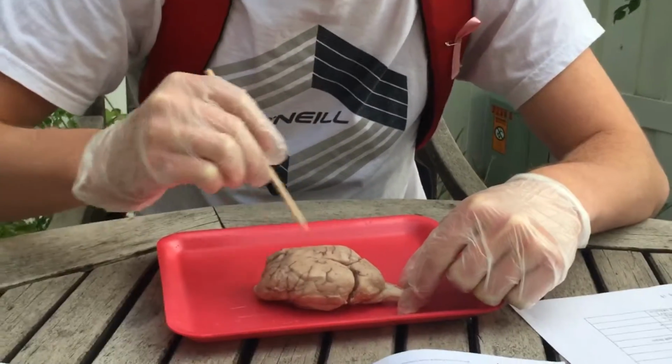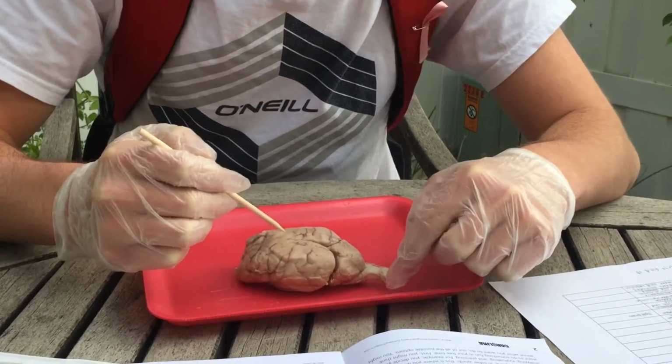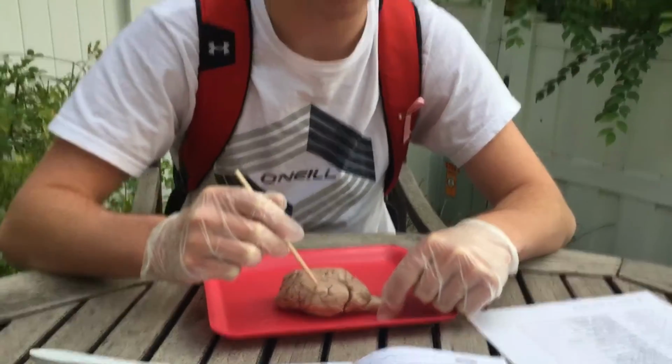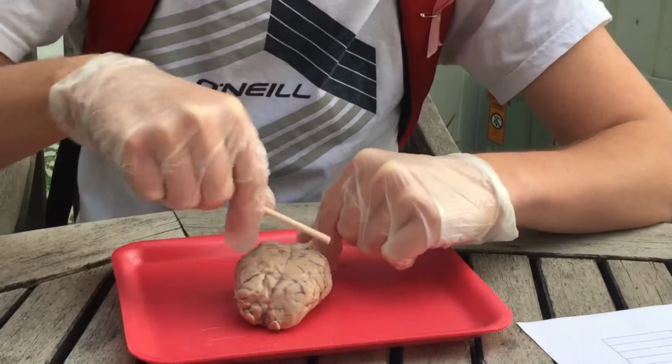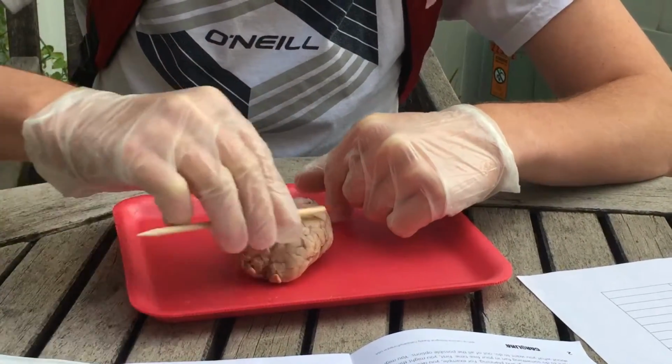And then this bigger part is the cerebrum. The cerebrum is involved with higher order thinking, for example, analyzing, evaluating, and planning, stuff like that. And then we have the left hemisphere and the right hemisphere of the brain, just split in half. It's pretty easy.